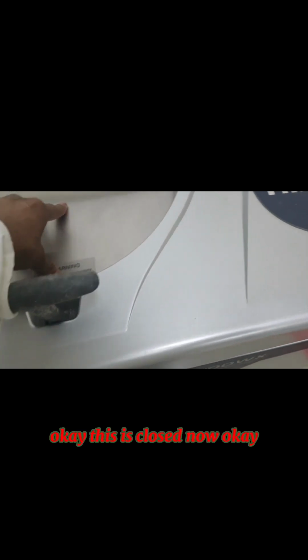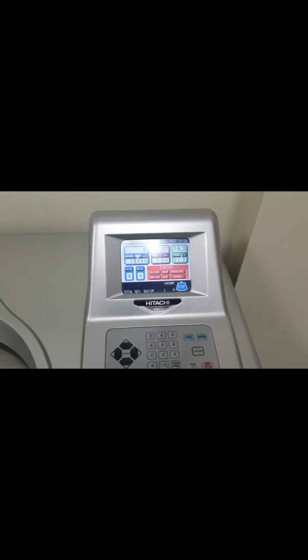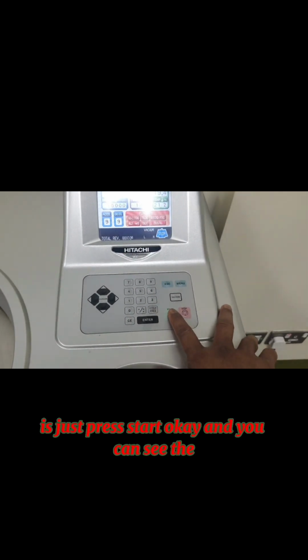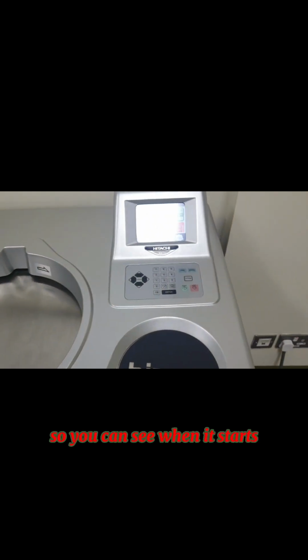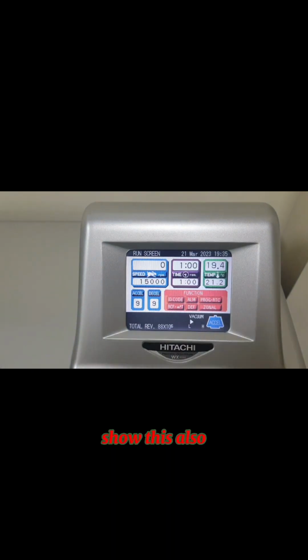This is closed now. Now for starting, what we have to do is just press start. You can see everything is appearing up here on the screen. So just start. You can see when it starts, it shows this.